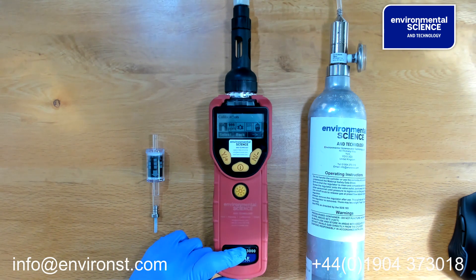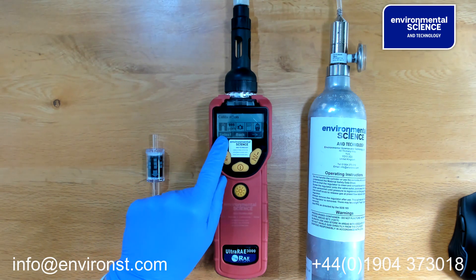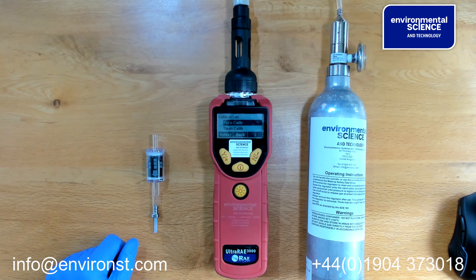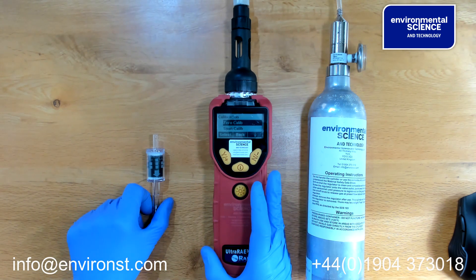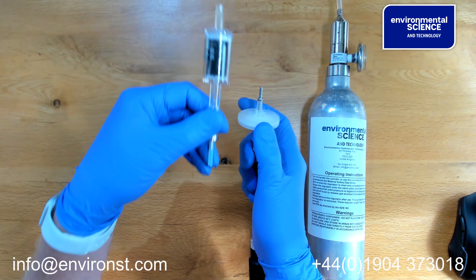You may be prompted for a password, which is four zeros if required. You then go to the calibration icon and press select. If you're in a zero VOC environment, you can zero using normal fresh air, or you can apply the zero filter to the unit.